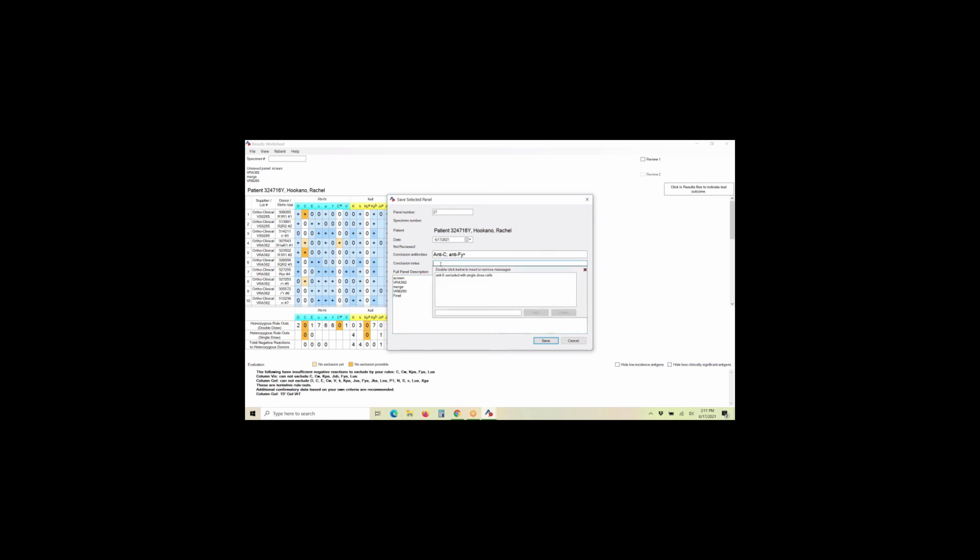You could put something like, that's a previous comment that was used, but that's not what we want to use. See, once you use a note, I believe you can select from it. Alan, that's a question for you, but I believe that's what it is. So here I would put something like, you don't have to do this, but you could.